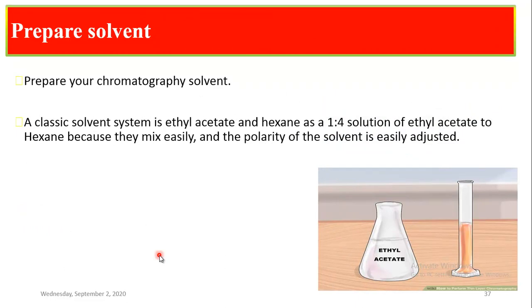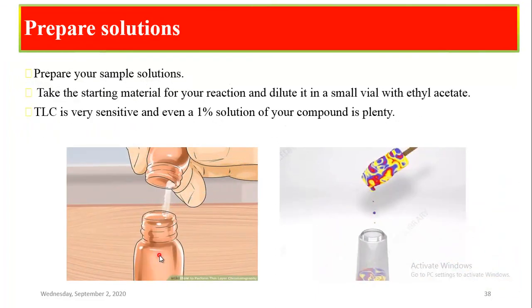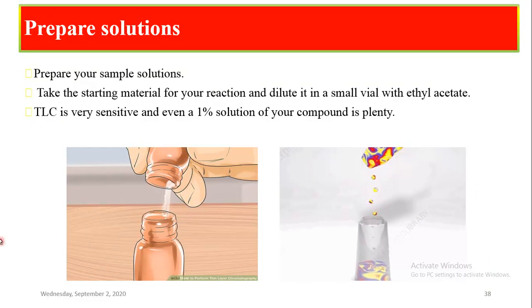Now preparing the solvent which is used for the practical. Depending upon the nature of the substance, polar or non-polar, we will prepare different types of solvent. Now, the solution or sample solution.